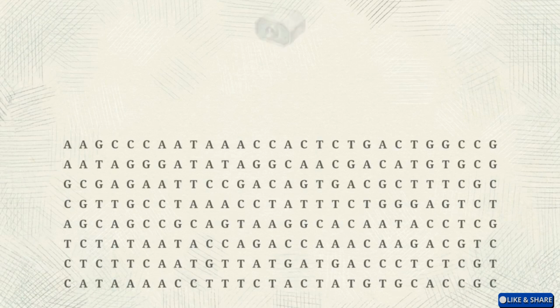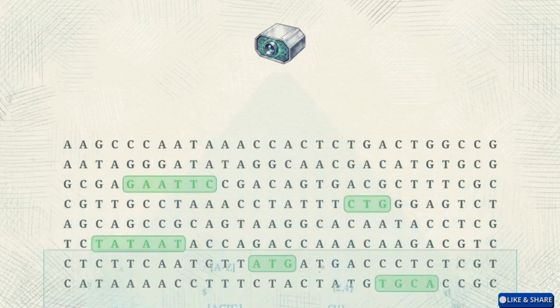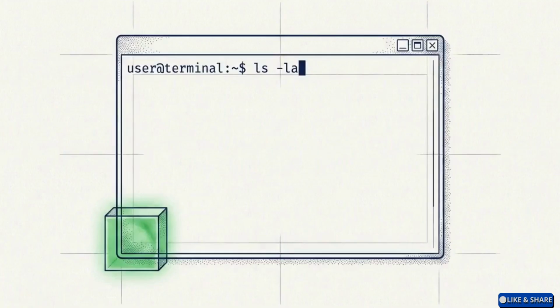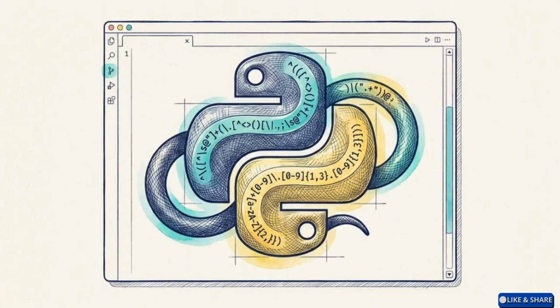The algorithmic solution to this strictness is regular expressions, or Regex. Regex is not an independent programming language. It is a universal syntax for pattern matching, acting as an analytical layer over text-based data. Its utility in bioinformatics comes from its ability to translate biological ambiguity into strict mathematical search logic. We will build this logic from the ground up, starting with basic literal matches, expanding into complex pattern logic, and deploying within a Python pipeline.